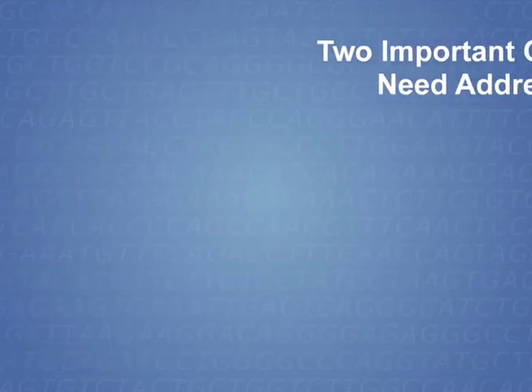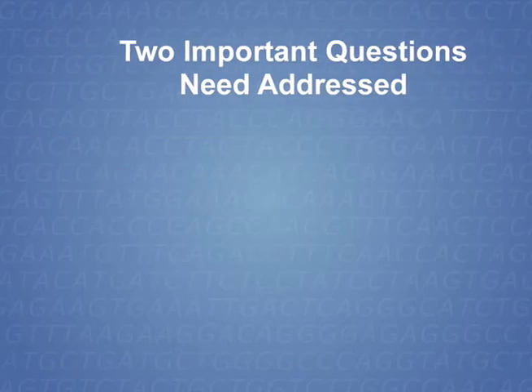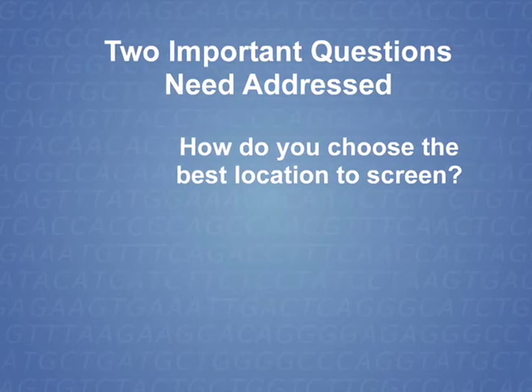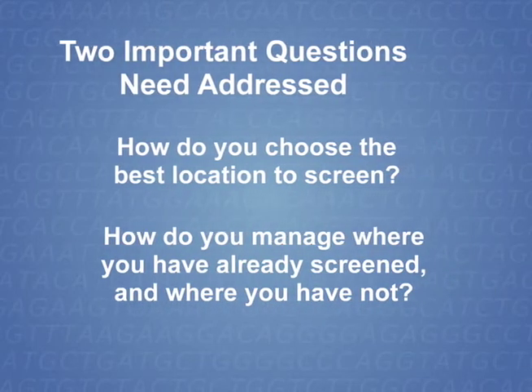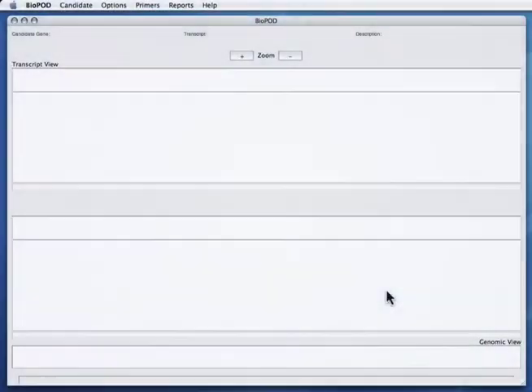This begs two very important questions. How do you choose the best location to screen? And how do you manage where you have already screened and where you have not? Biopod is the answer to both of those questions.